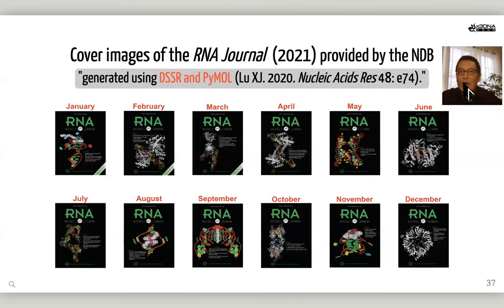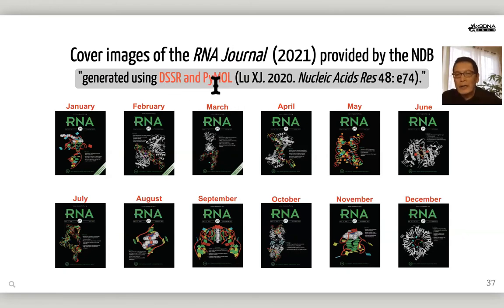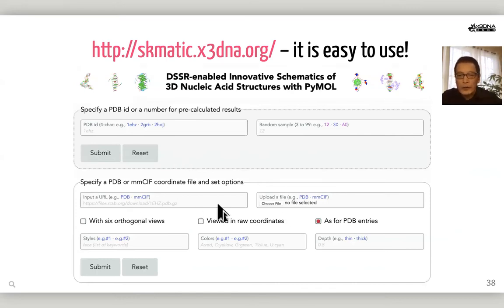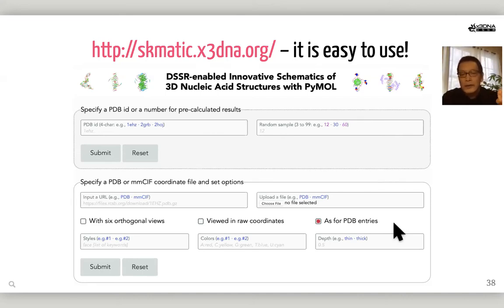Here are 12 cover images of the RNA journal in 2021. The images were provided by the NDB, generated using DSSR and PyMOL. The 2020 NAR paper was explicitly cited. You can generate all these schematic images very easily using the web interface. You can click a PDB ID or upload your structure simply by using a URL or uploading a PDB or mmCIF file. You can customize it using common options, or download the PyMOL session file to customize in any way you like.